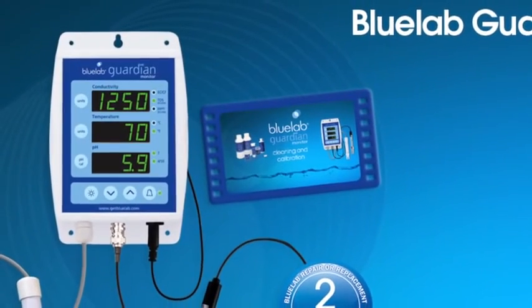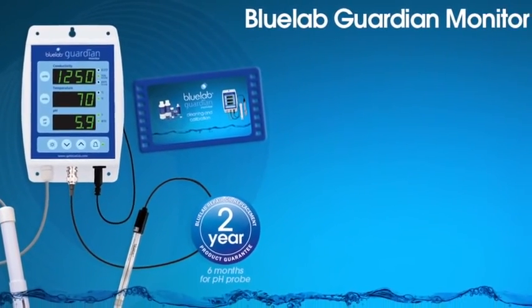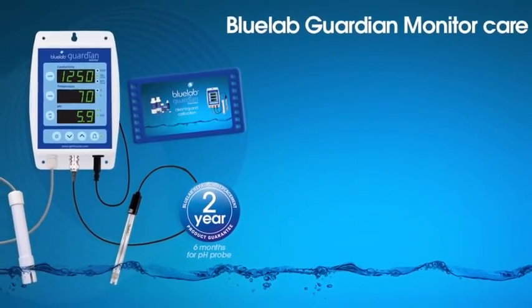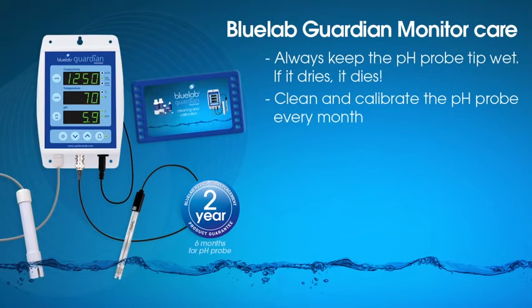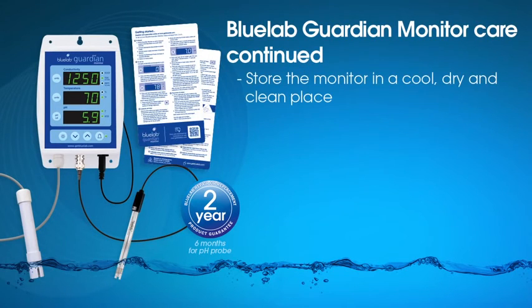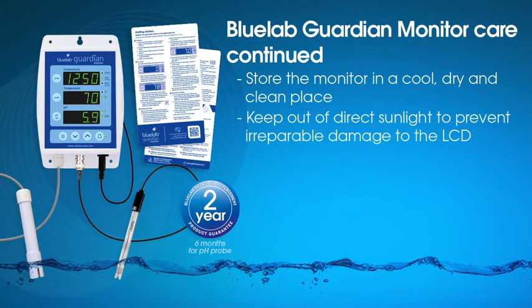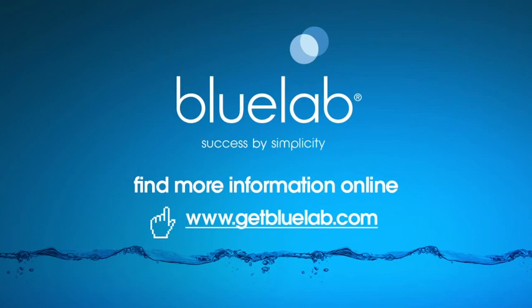We at Bluelab hope you enjoy using your Bluelab Guardian Monitor. To maximize the life of your monitor and equipment, we recommend these care steps: keep the pH probe tip wet — if it dries, it dies. Follow the full cleaning procedures for both probes each month. You can watch the Bluelab Guardian Monitor cleaning and calibration video online if you need a refresher. Position the monitor in a cool, dry, clean place and keep out of direct sunlight. If the monitor gets wet, wipe dry immediately. For more information about Bluelab products, visit www.getbluelab.com.